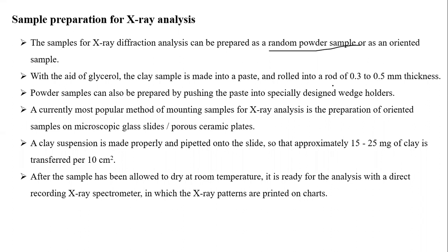Actually, if anybody has experience with X-ray diffraction, they will load the sample into a rod of 0.3 to 0.5 mm thickness. This powder sample can also be prepared by pushing a paste into specially designed wedge holders. There are a few holders, wedge holders, that they use, and we push the samples in.